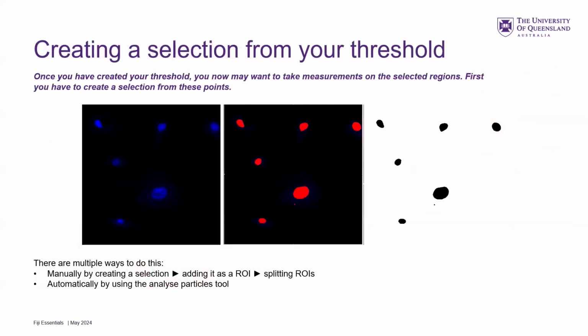So we're going to work through what I think would be a somewhat typical workflow. And I'm going to use a cell here. It could be a nucleus. It could be a bacteria. It could be a crystal. It could be a bead, whatever. But use your imagination. We're going to find an object, and we're going to do some things so that we can then measure it.